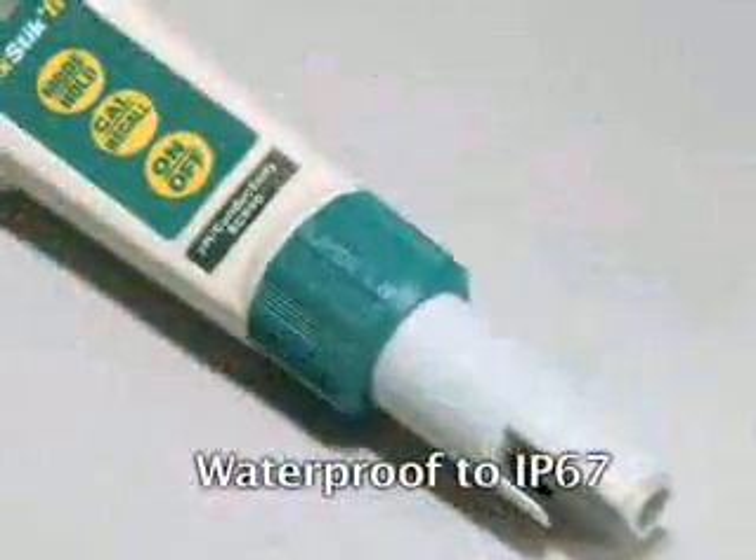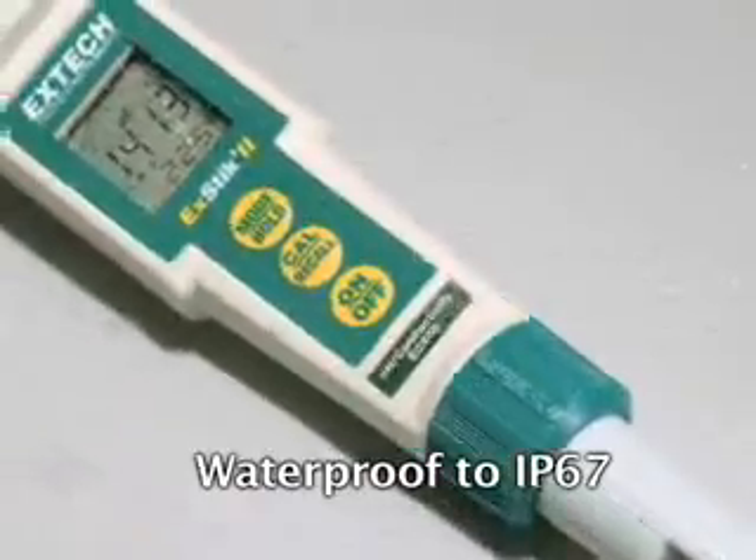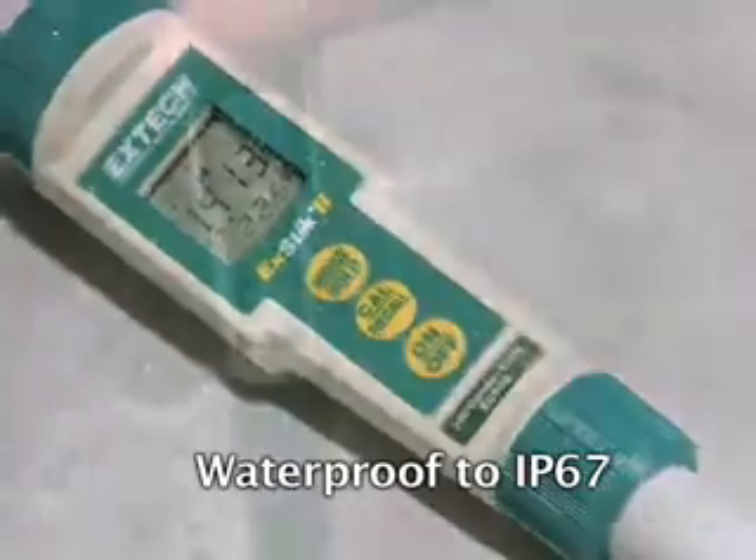The EXTEC2 conductivity meters are waterproof, meeting the standards of IP67. This assures safe and accurate measurements even in extremely wet sampling conditions — and it floats.